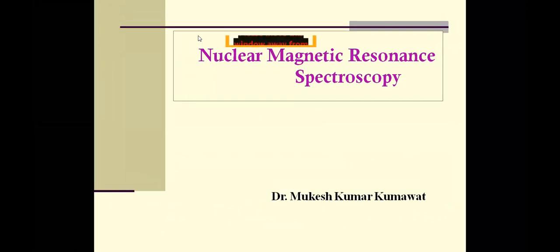So, students, we had discussed, continuing from the last class, NMR, nuclear magnetic resonance spectroscopy. What I have discussed with you, I am revising again before starting another part.